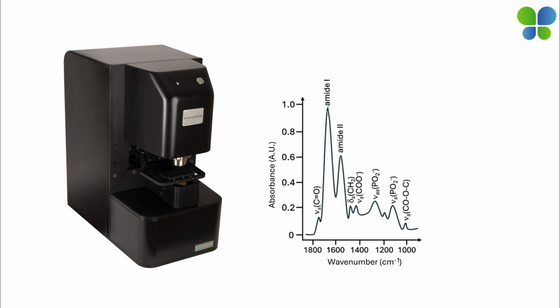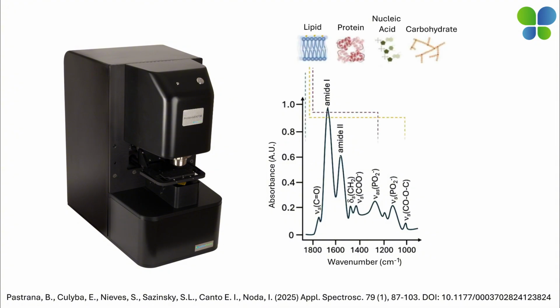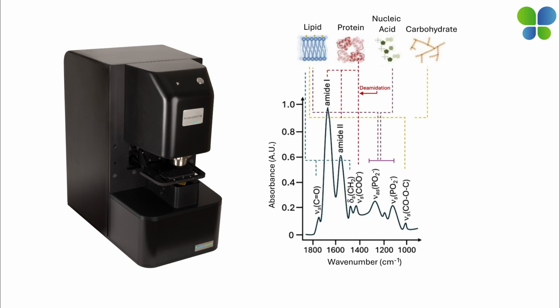Its rapid method of analysis is highly selective and sensitive, aiding in the exploration of new modalities, and provides a clear understanding of the protein dynamics in solution with direct amino acid level resolution.